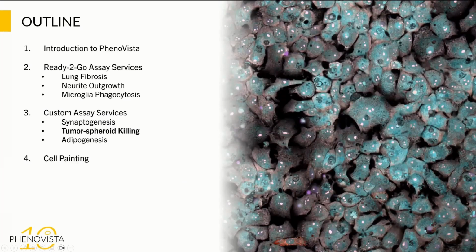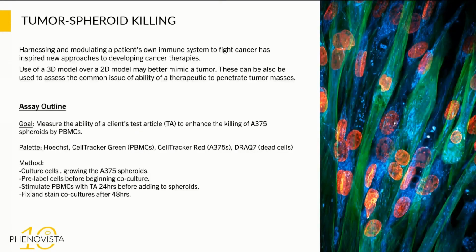So, shifting gears a bit away from CNS, we do have a number of oncology projects that we have performed in the past, and I'll take this into a 3D assay as well to showcase some of those capabilities. One of them that we get asked about a lot is tumor spheroid killing.